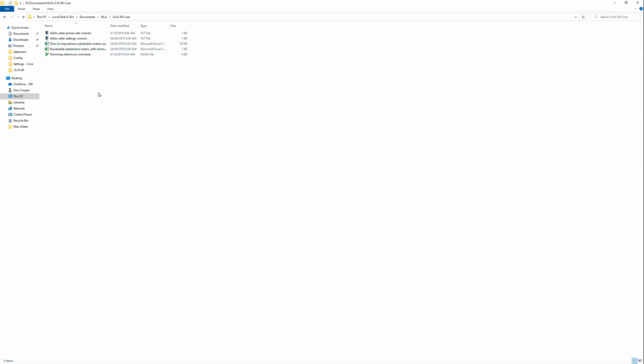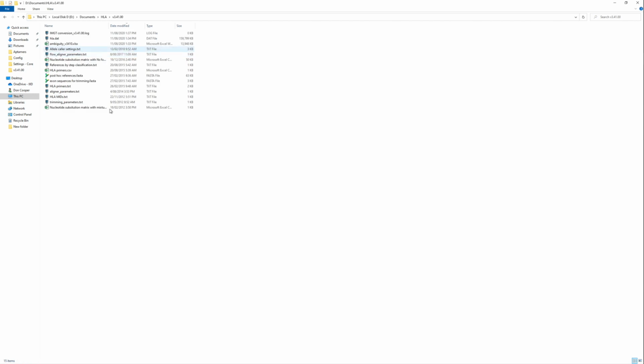And then comes the slow part, which is when it reads in that big Dat file and extracts all the HLA data and creates the reference files which will have v3.41 in their name. So this will take quite a few minutes, and so we just have to sit by and be patient. So you see now it's created the allele groups 3.41.